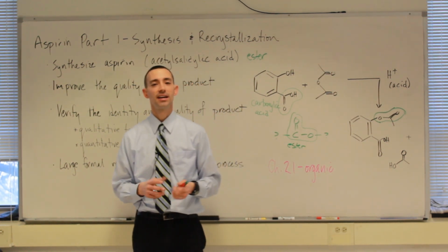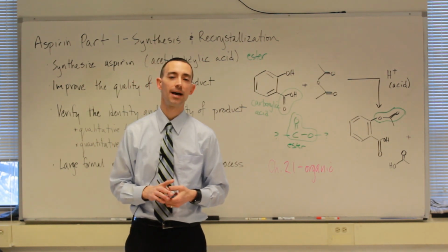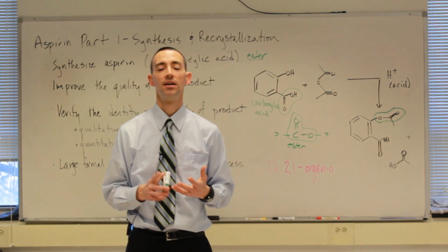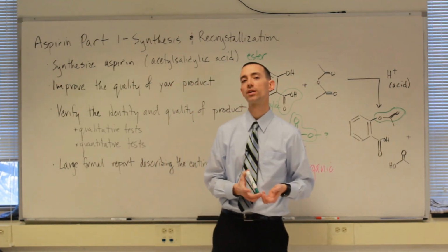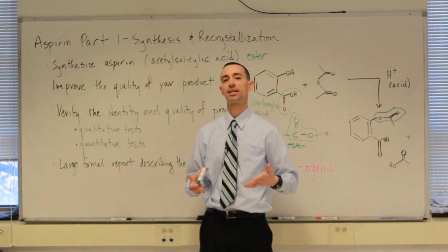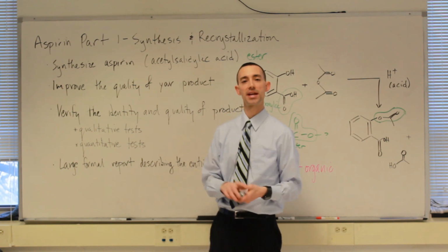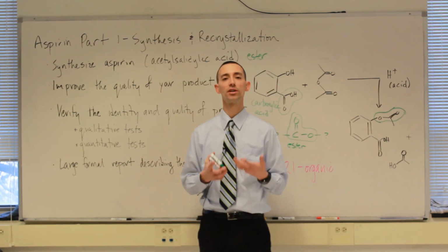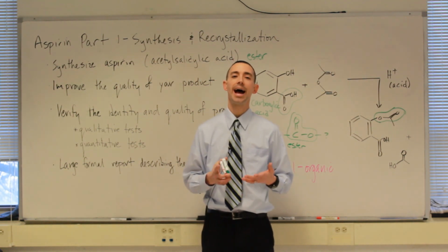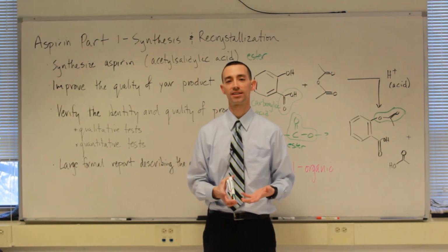The last thing I would like to urge you to do in this lab is to take your time. Don't rush the synthesis and the recrystallization. I know it's tempting to want to get out of lab and you have many other things to do, but in this case, literally your time is going to decide how good your product is.